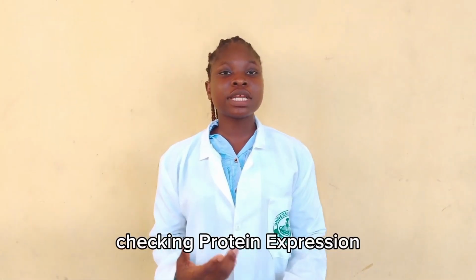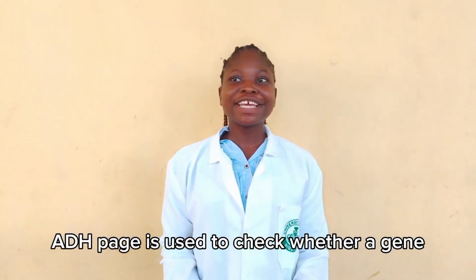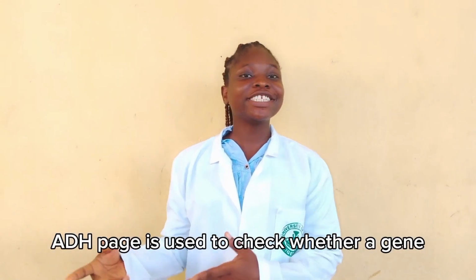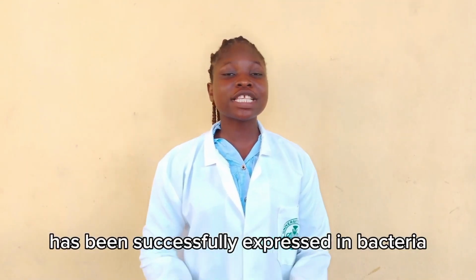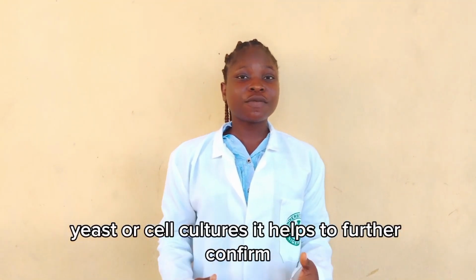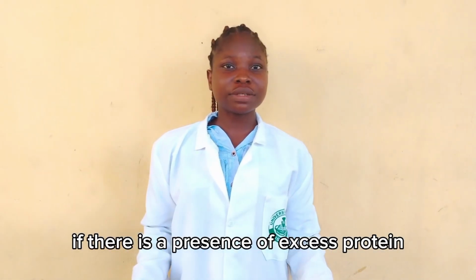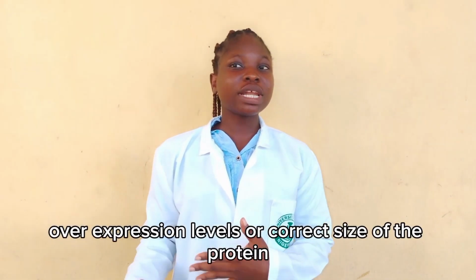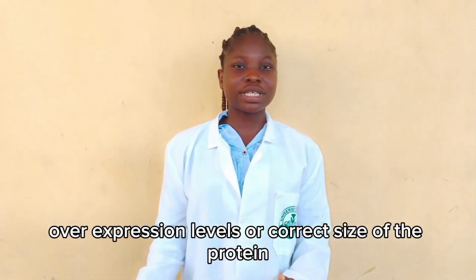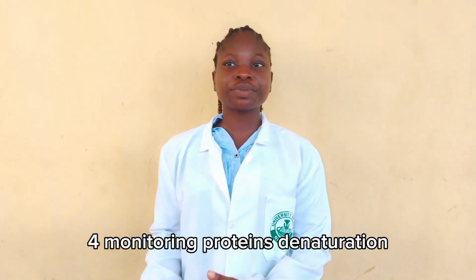3. Checking protein expression. In biotechnology and research, SDS-PAGE is used to check whether a gene has been successfully expressed in bacteria, yeast, or cell cultures. It helps to further confirm the presence of excess protein, overexpression levels, or correct size of the protein. 4. Monitoring protein denaturation.